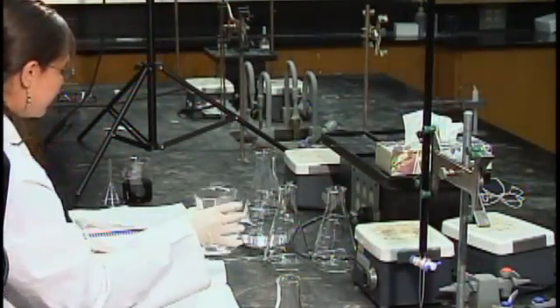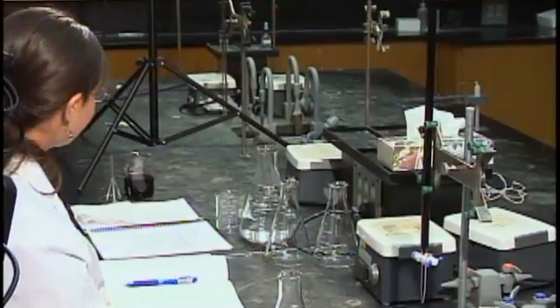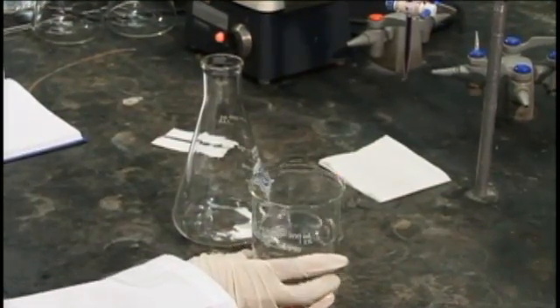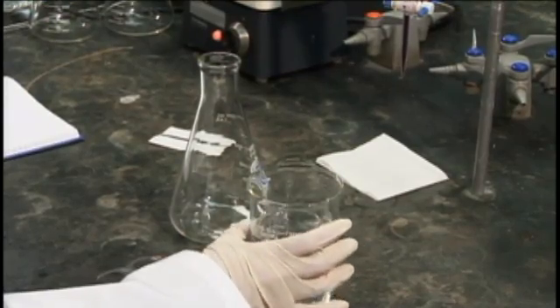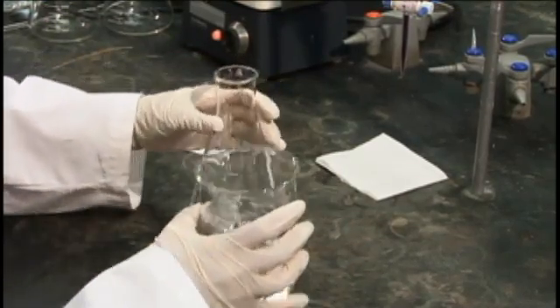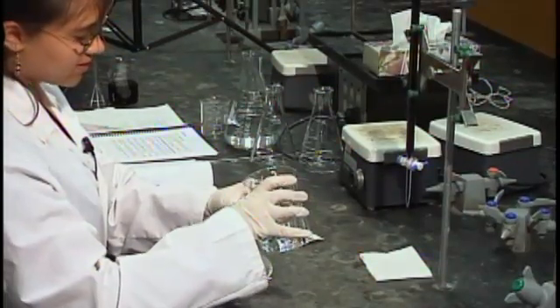So then in step 5, I'm going to add 250 milliliters of 1 molar sulfuric acid that we made in step 2 to our sodium oxalate here.